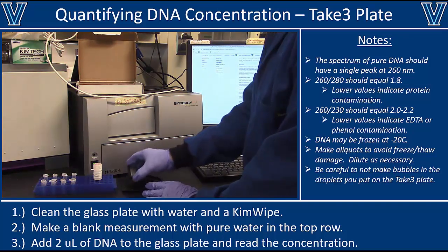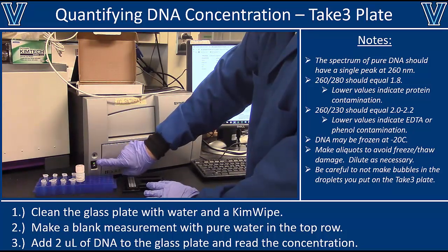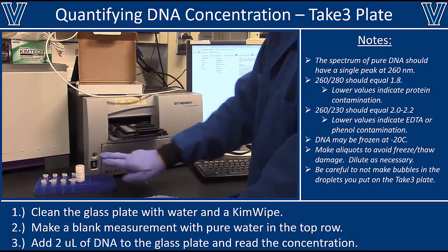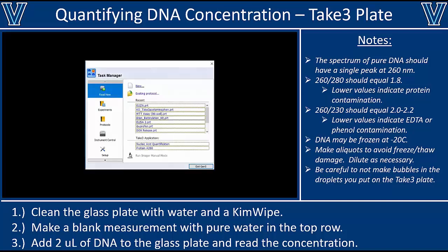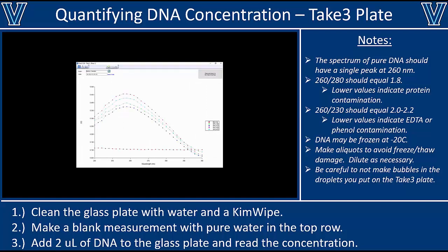But here we go. Once we've got the samples loaded, we carefully close the Take3 plate as shown. Make sure the plate reader's on if you haven't turned it on already. Open the tray and then close it. And now we're ready to open the Gen5 software. So when you open that, this is what you'll see. Click on nucleic acid quantification and then set where your blank and your samples are. Then you can click read and this is what you should get.